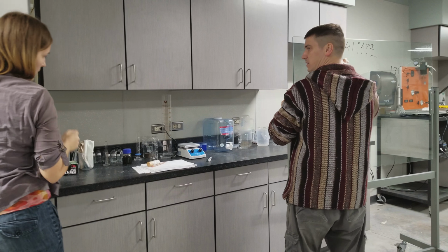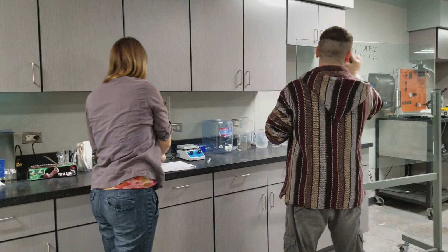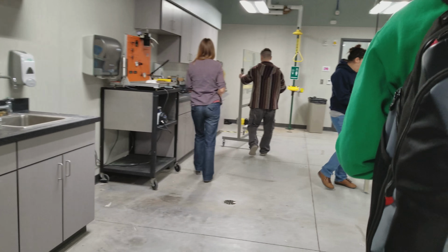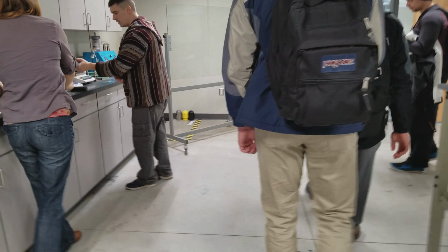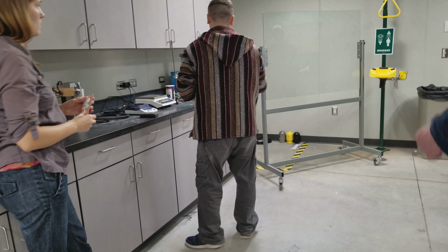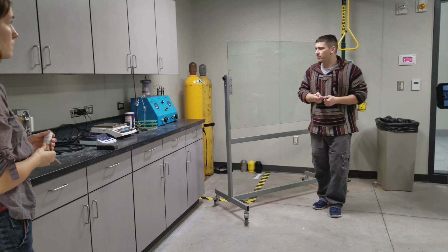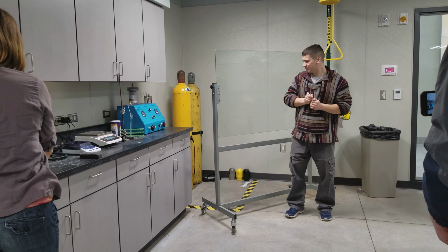Surface tension and capillary pressure. We have 2 more to go in this room. The next one up here is an apparatus for measuring capillary pressure.